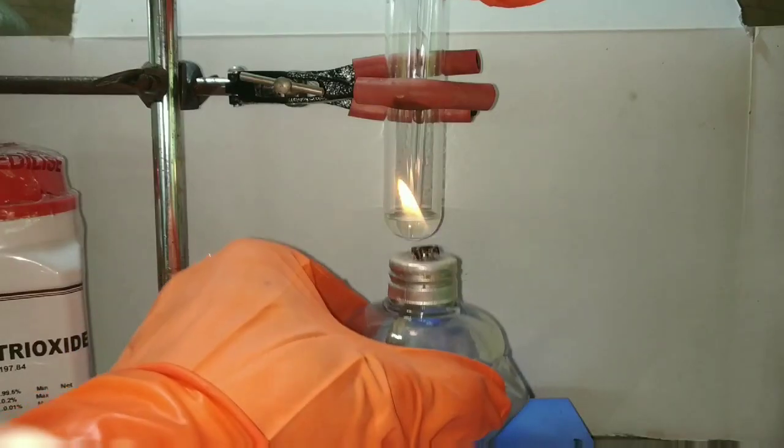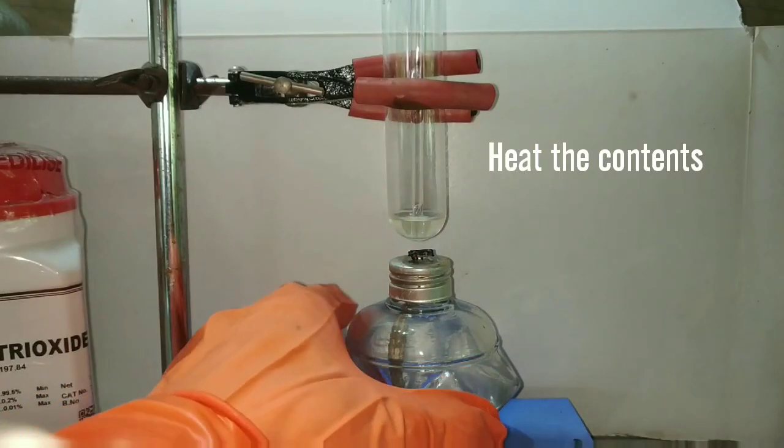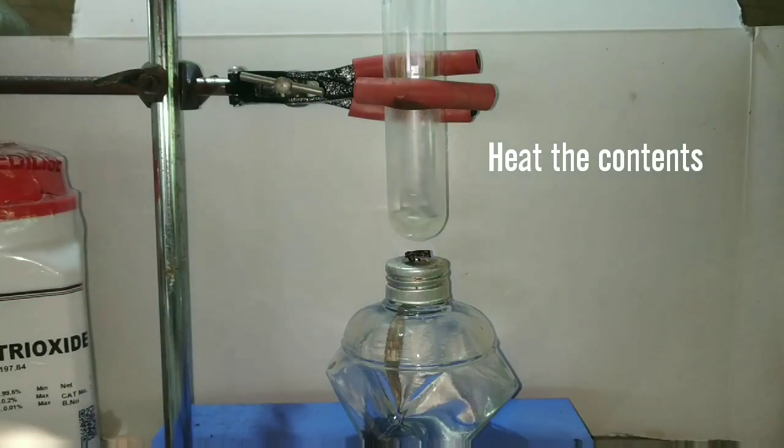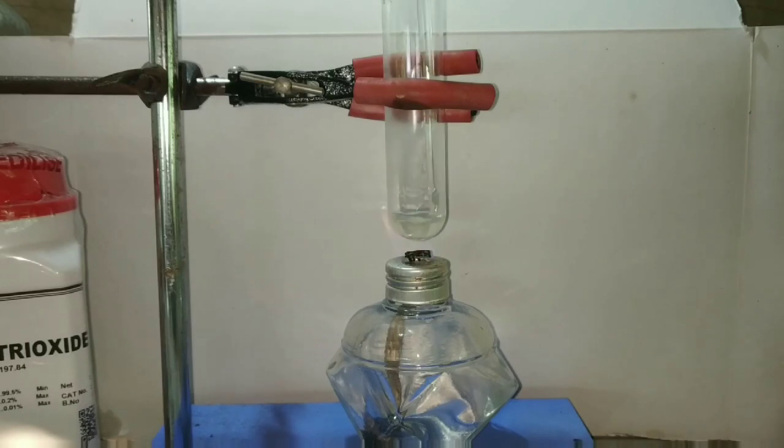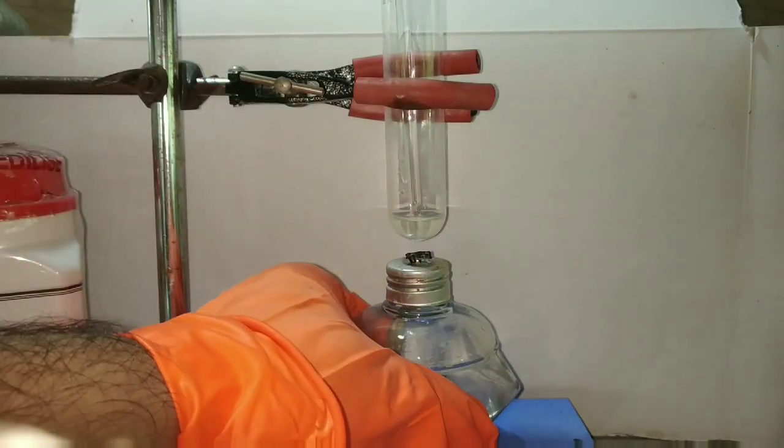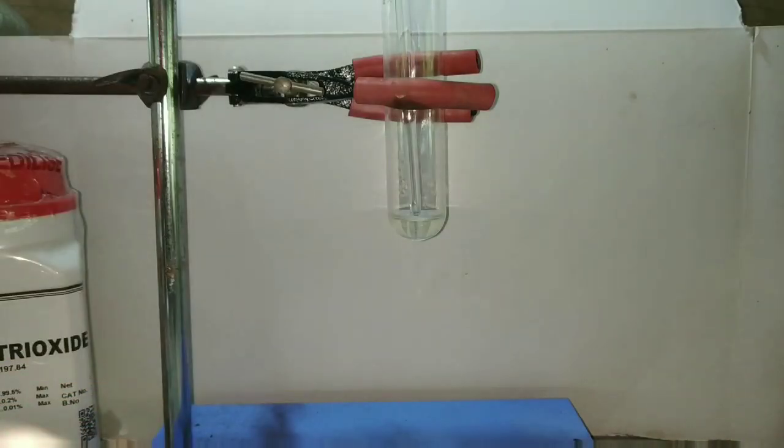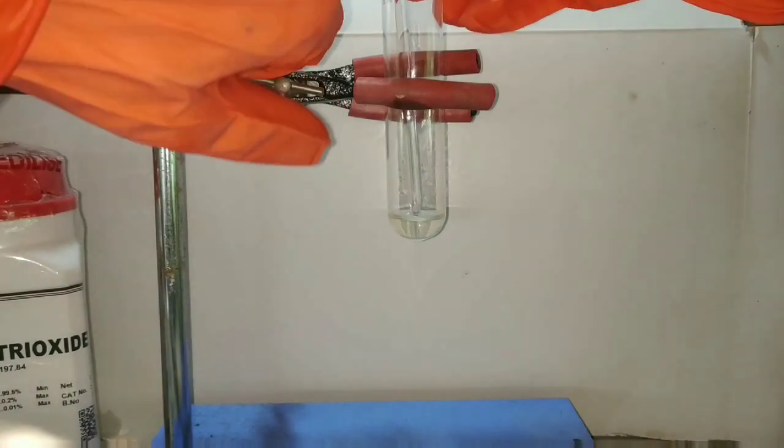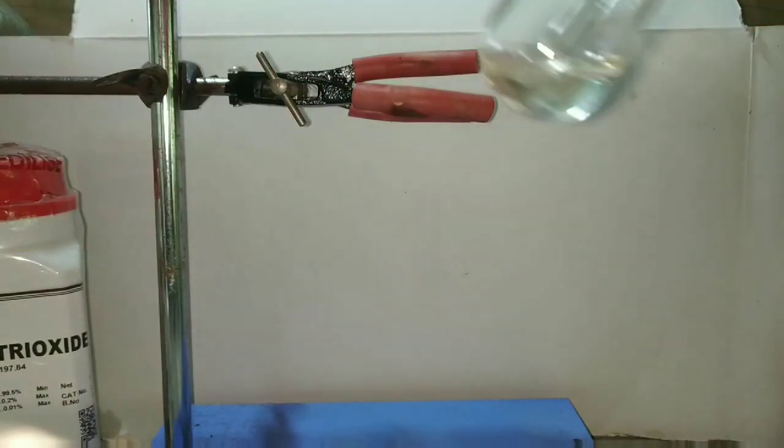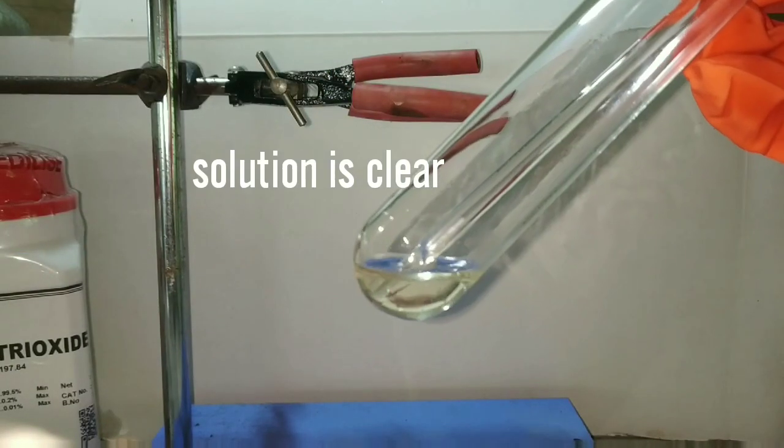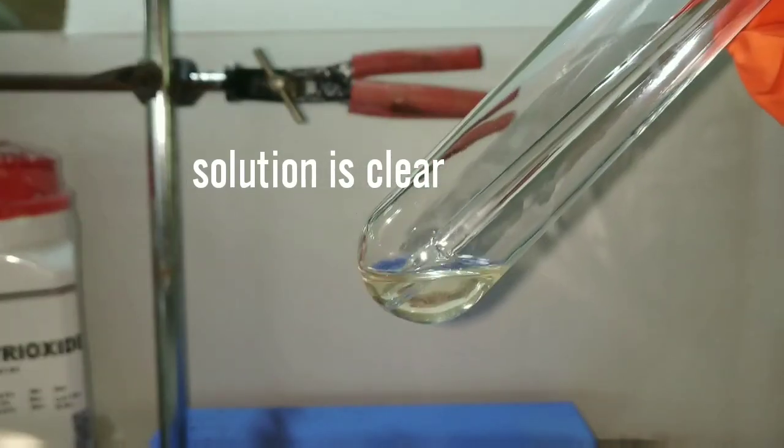After adding the hydrochloric acid, we heat the contents so that the reaction takes place much faster and mix it thoroughly. You can see that the reaction has taken place completely and the white arsenic trioxide has completely dissolved and the solution is clear now.